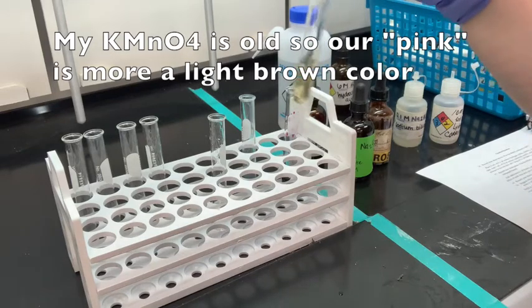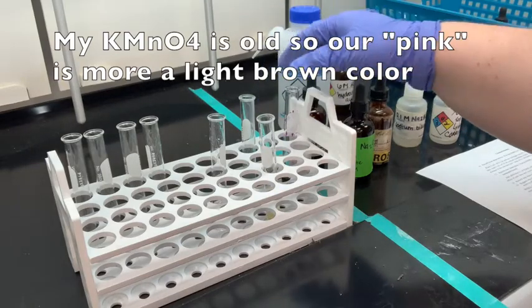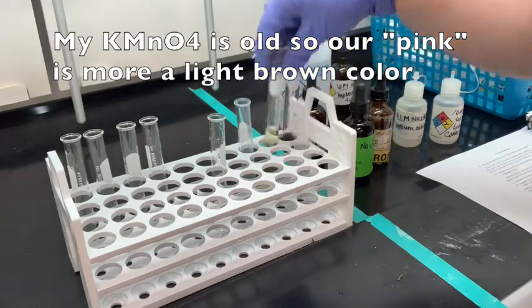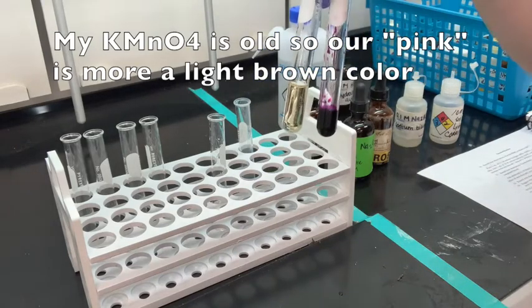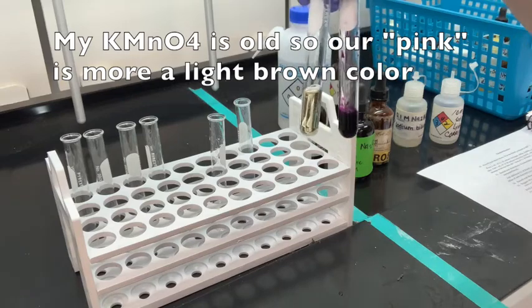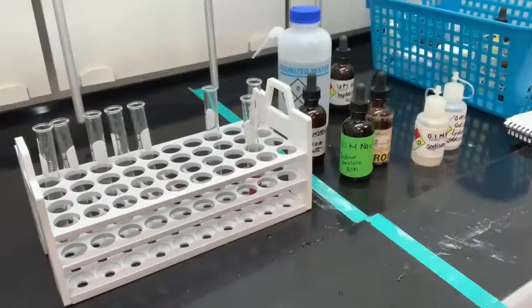My potassium permanganate is a little old, so it's more of a light brown color rather than light pink. We went through a phase where it was kind of pink, but it's definitely changed. You can say in your report sheet that the permanganate has been reduced to Mn2-plus, manganese 2-positive.